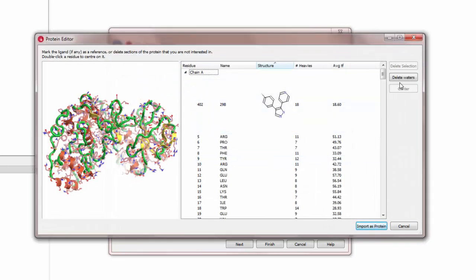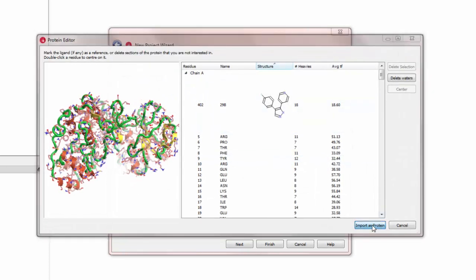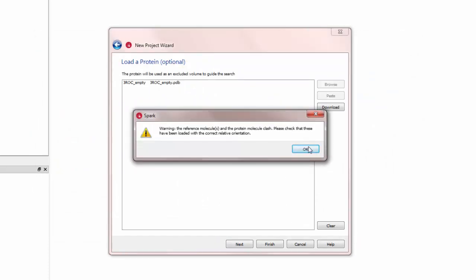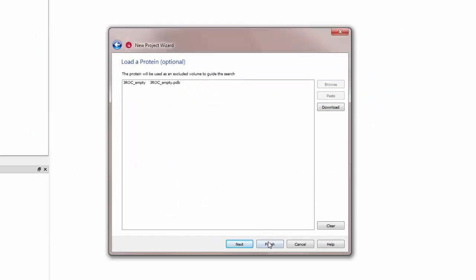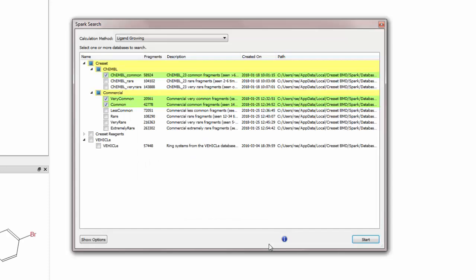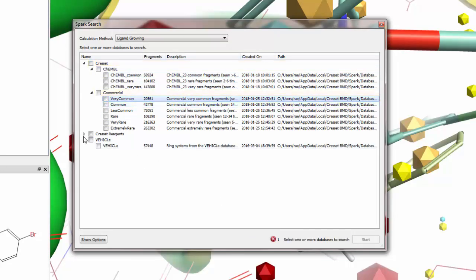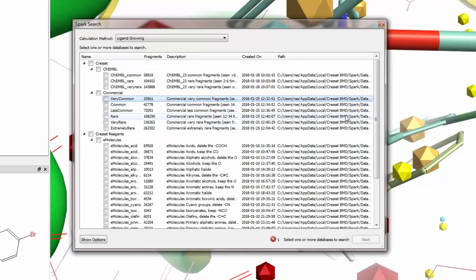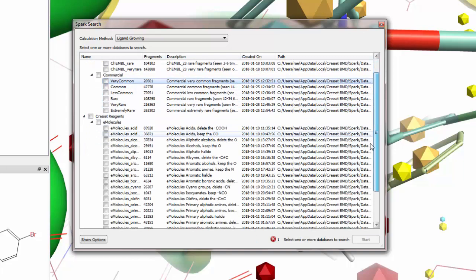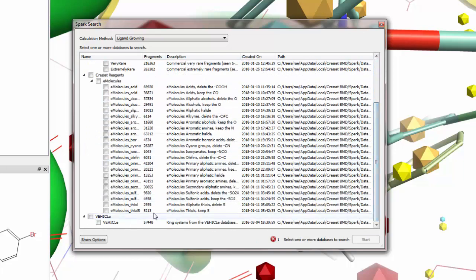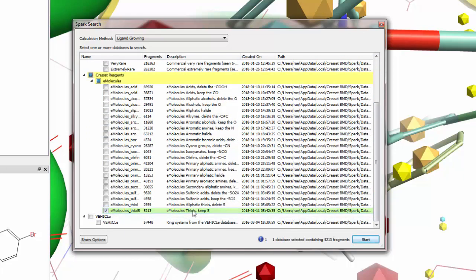Now I will tell Spark where to look for bioisosteric groups to grow onto the 3ROC ligand. In the Cresset reagents I will find the thiols database where the sulfur was kept. This was derived from the e-molecules reagent collection.